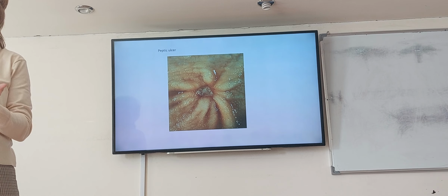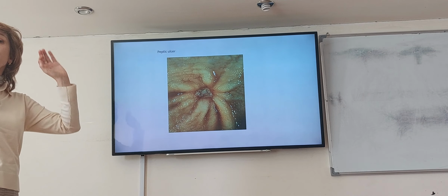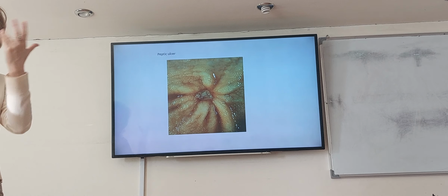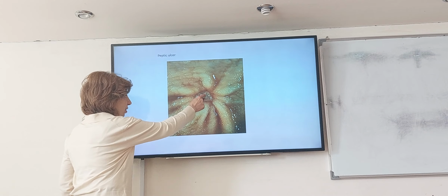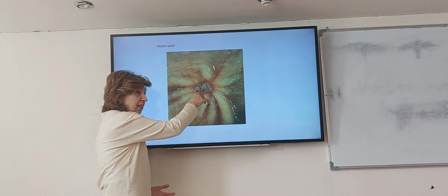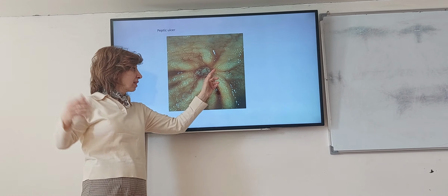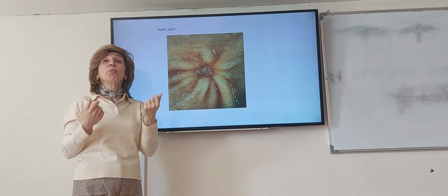How I will see grossly? This is your job. Yes? You will do endoscopy and you will see this picture. Of course, you will send biopsy to us because at the end pathology decides, but you will have direction, 70-80% direction. This is central ulcer that is low. Look at it. It is low in level because I will put the picture. Yes? And I will see the folds radiating from this central ulcer, and the folds have smooth covering. They are not necrotic, friable material that I will see in malignancy.